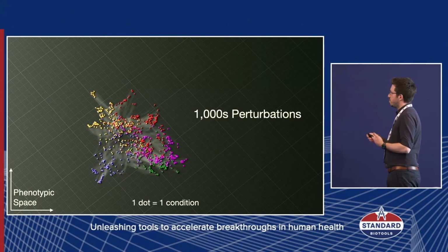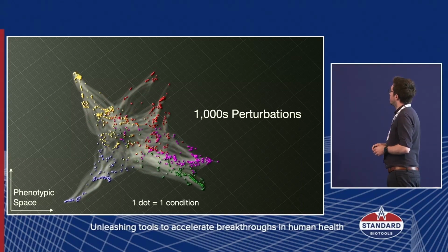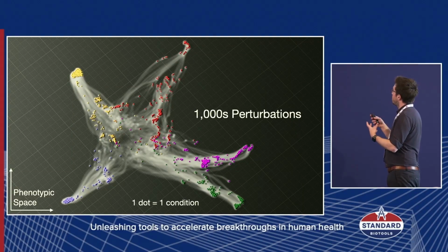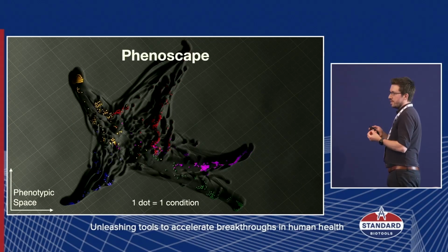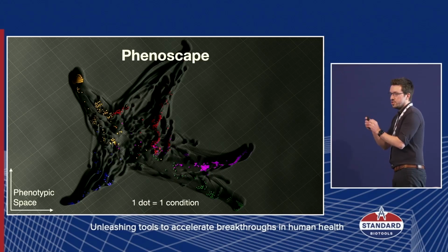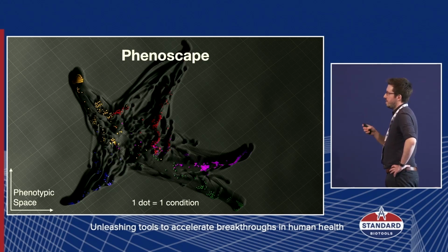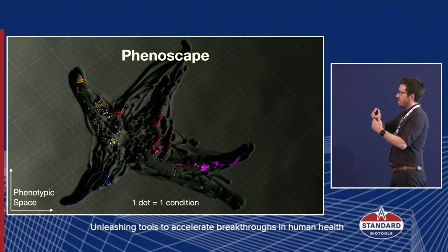So these can be growth factors, mutations, microenvironmental cues, matrix stiffnesses, all sorts of things. And the crucial thing to observe here now is when you look at these kind of embeddings, each dot is a single condition. It's not a single cell. But inside each dot are thousands of single cells. So you will see embeddings in my talk today that look a bit like single cell plots, but actually each dot is a condition. And if any of you have ever done omics analysis and then on a PCA, for example, of that afterwards, and you see your dots moving around in a PCA plot, that's essentially what you're doing. But in the PCA example there, each dot comprises a gene list, but for us, each dot now comprises a cell list with features per cell.